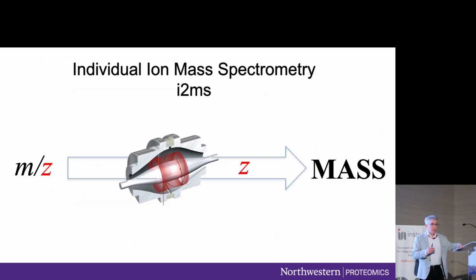So here I'll tell you a little vignette about a new technology that makes it significantly easier to do proteoform discovery and dynamics, and that is this transition to single particle mass spectrometry. It's useful in both denatured and native modes using electrospray. I'll come back to define those terms if you're not familiar, but I bet most in the room are. It involves a shift in that mass spectrometers never really lived up to their name.